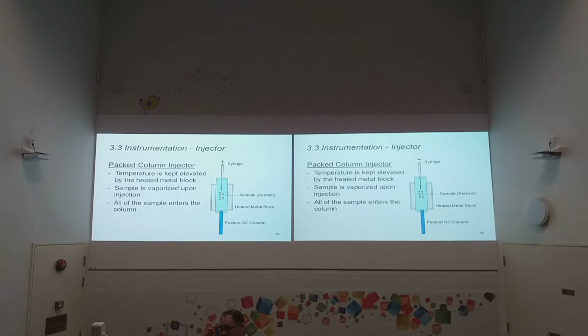So when you introduce the sample inside, you can easily introduce 1 ml. Can you now visualize how much 1 ml of the sample is? Is 1 ml a lot? No, not a lot. With a medical syringe, can you manage to do that? Yes. What happens if I ask you to reduce the sample size? You just need to introduce half a ml. Based on your experience, based on imagination, can you do that? Yes, still yes. You take a smaller syringe.